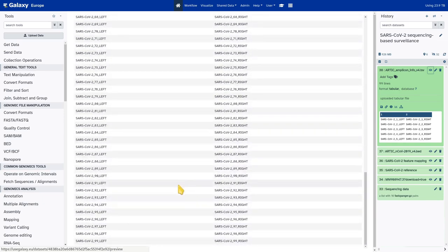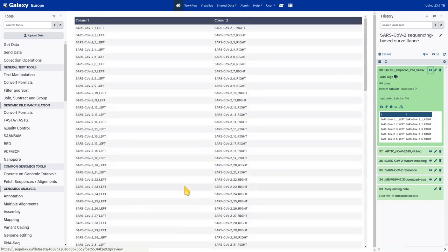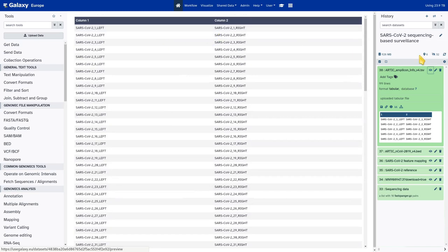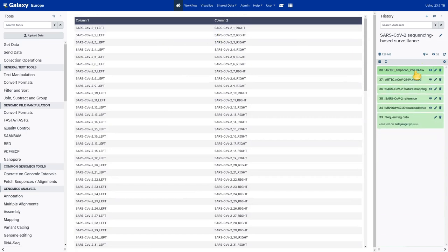Normally each line has two primers. For some primer schemes that use nested primers to produce a single amplicon with higher specificity or efficiency, there might be more than two primers on a single line. So all the input datasets seem to be ready.